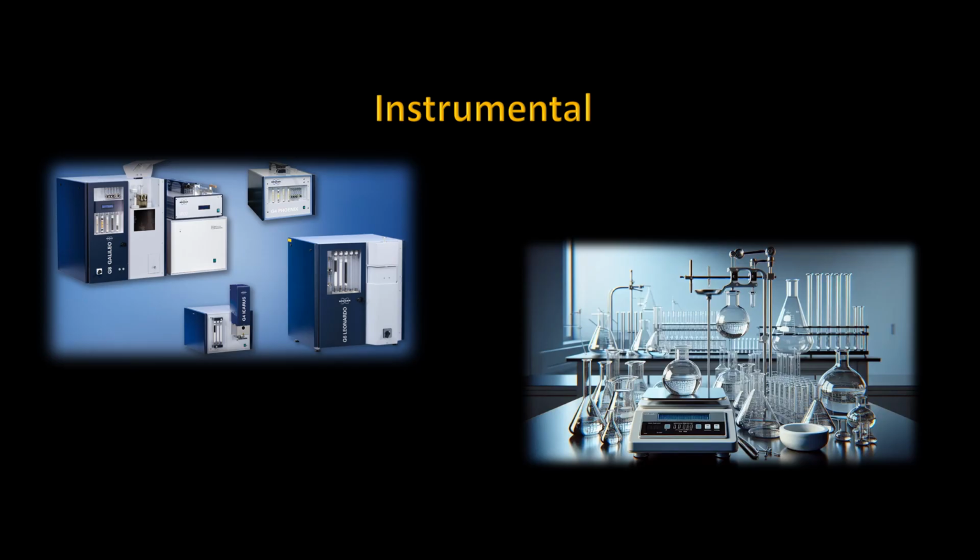All that is required is glassware and associated hardware such as stands and clamps, a hot plate, a good lab scale, a centrifuge, and a fume hood. It is true that analytical grade chemicals are expensive, but small amounts are used, which goes a long way, making them affordable in the long run.